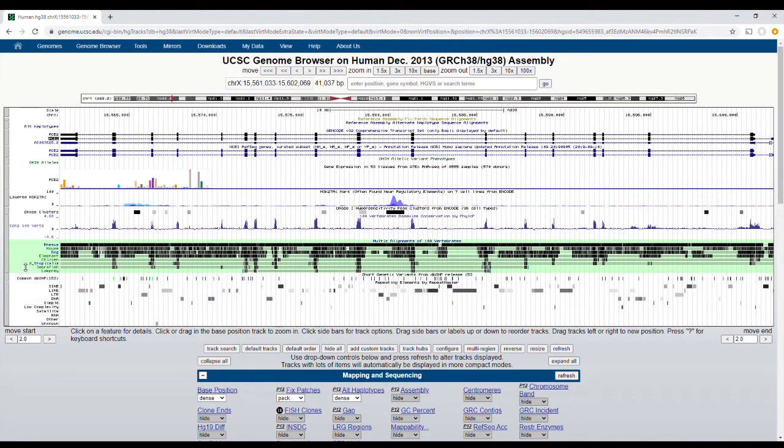So when you look down closer to the bottom of this window where I'm hovering, zebrafish and lamprey are both fairly low in terms of consensus sequences, or common sequence of my gene, and I'm deriving that based on this black marking that shows me the identical residues.